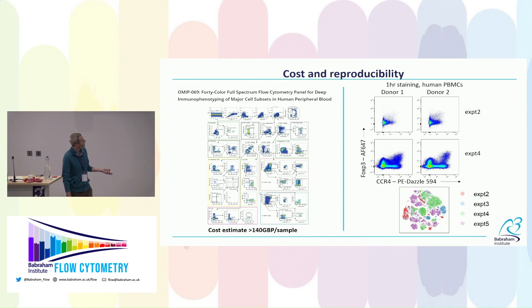The second issue — batch effects — affects even experienced cytometrists. This is human PBMC data run on a well-validated 25-color panel on the Symphony: same donors, four different batches, run by the same experienced person. You get very clear segregation on the tSNE by batch. Individual markers like FOXP3 and CCR4 look quite different between experiments.